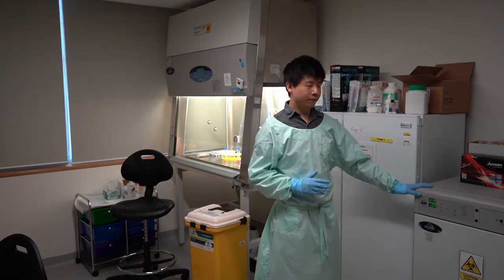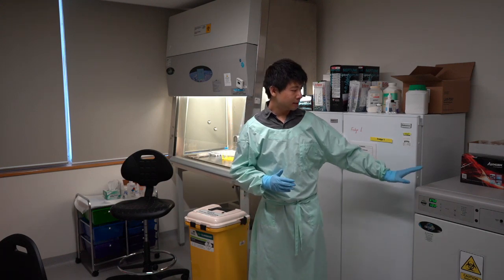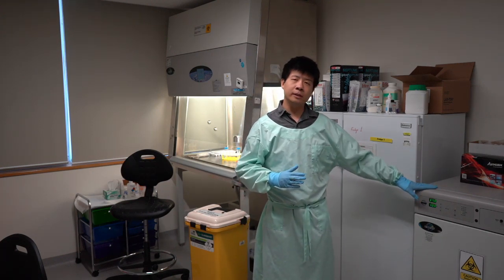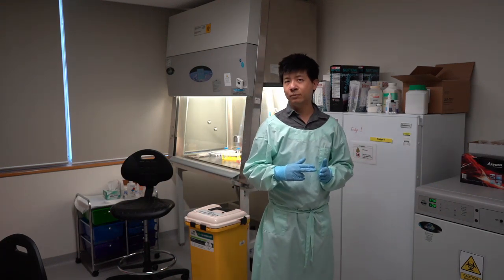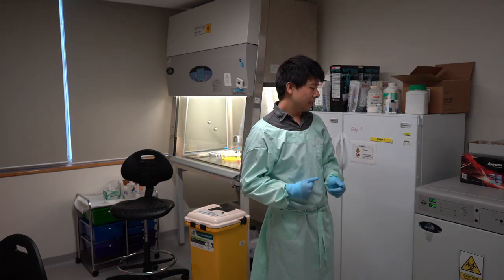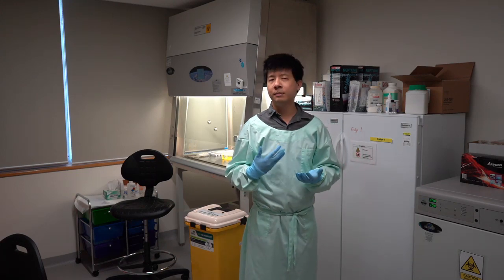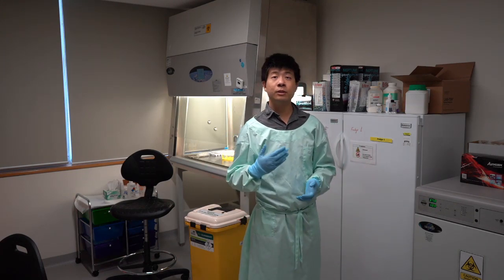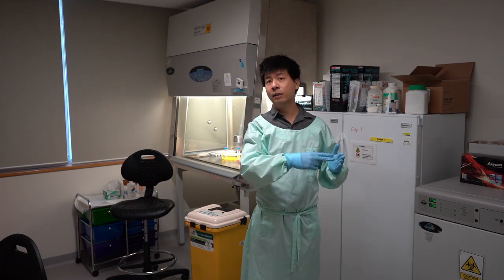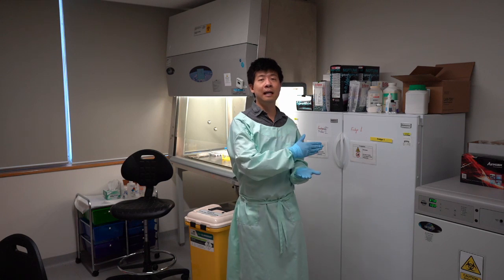Here we have a CO2 incubator. This incubator heats the cells at 37 degrees Celsius, which is general body temperature. It also provides control of carbon dioxide, which is used to control the pH within the cell culture itself, so that it's not too acidic or too alkaline.